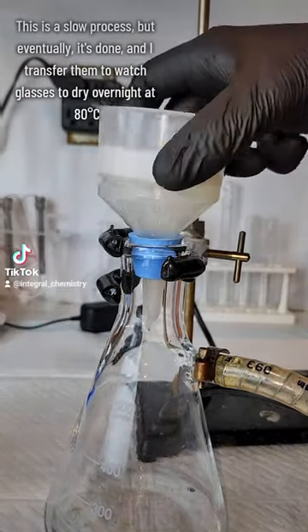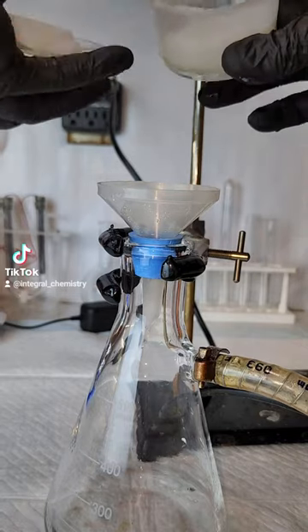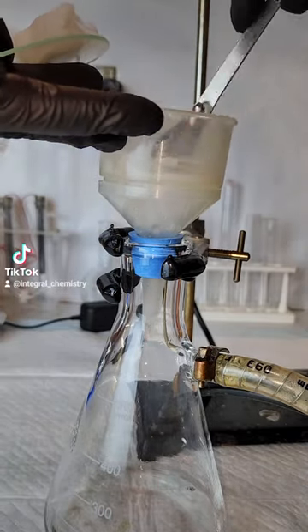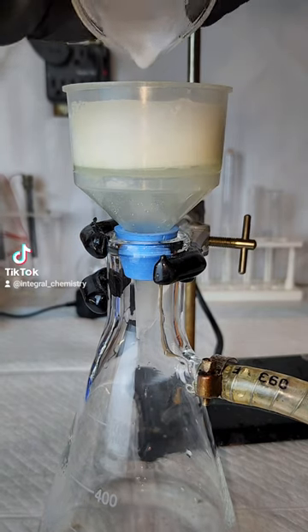Once most of the liquid is gone, I transfer my samples to drying dishes and then dry them in an oven overnight at 80 degrees Celsius. This leaves me with clean, pure yttrium hydroxide and indium hydroxide, and this is pretty much the hardest part of the entire process.